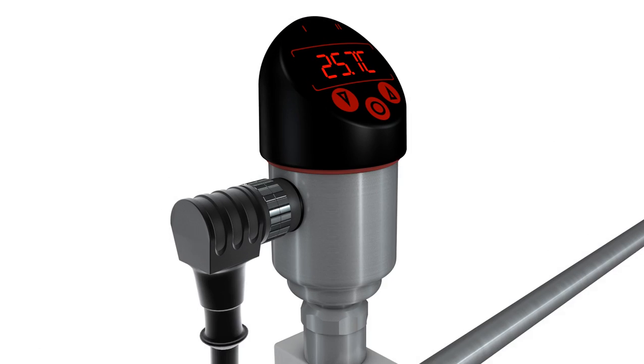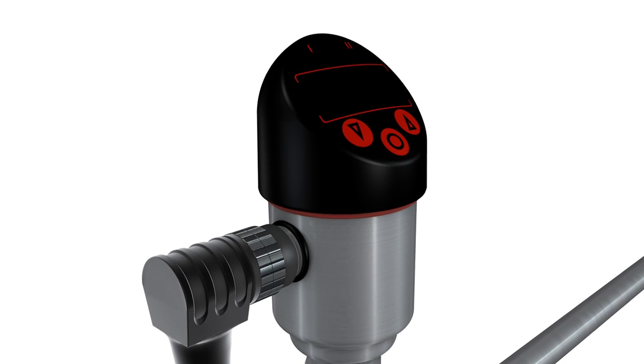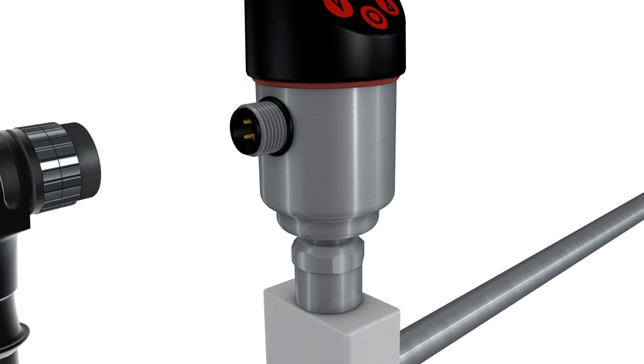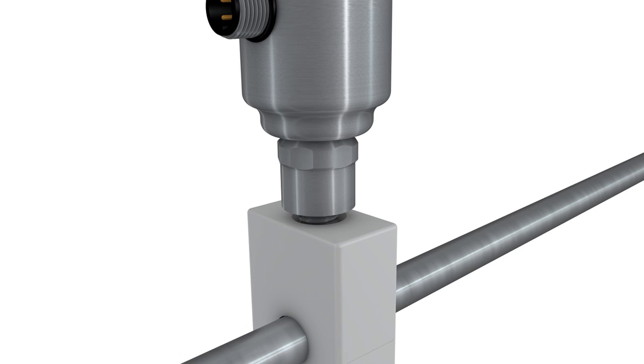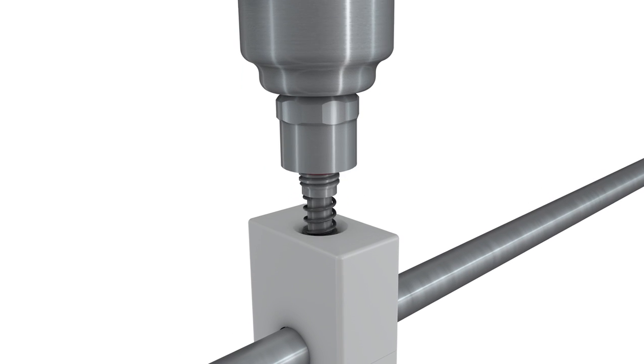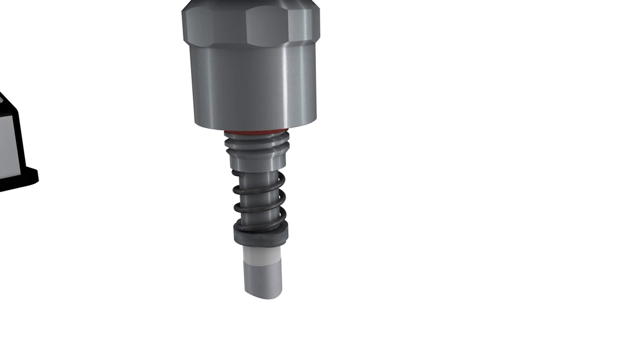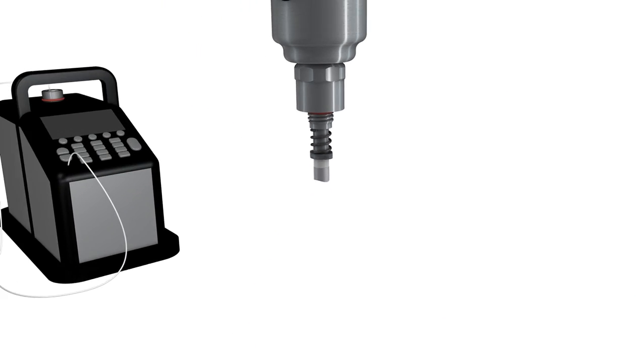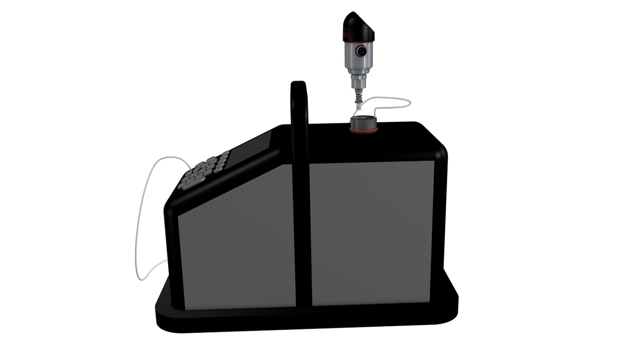Now we want to show you how easy it is to recalibrate the Labome clamp-on sensor. You simply unscrew the temperature sensor and remove it from the clamp block. There is no disruption to the process. The clamping block that defines the measuring spot remains on the pipe.